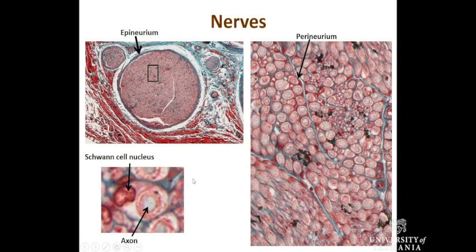So here's that cell that we're looking at there. Here's the nucleus of the Schwann cell, the axon, the myelinated axon, and here's the nucleus of a Schwann cell and several of the non-myelinated axons that it's associated with. Now, some of these nuclei may also belong to fibroblasts. Probably these darker ones, the smaller ones, are the fibroblast ones on the outside there. So for this example, this one here, you can see the collagen on the outside here represented in blue.